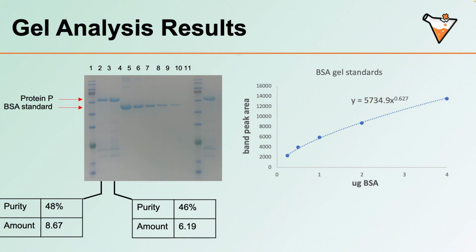That's what I'm going to do, and hopefully by the end we'll get a much better estimate of the protein concentration that I have. But ImageJ is going to be helpful to estimate things in the meantime. Also, we don't always have enough protein to use a spectrophotometer, so there's a lot of applications for ImageJ when you only have a tiny amount of protein, just enough to run a gel.